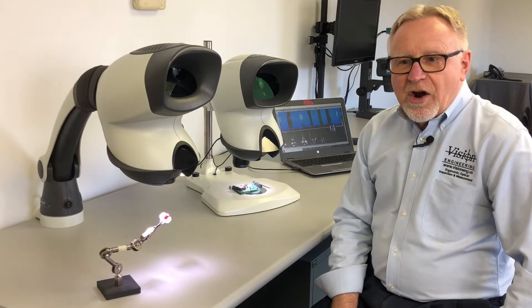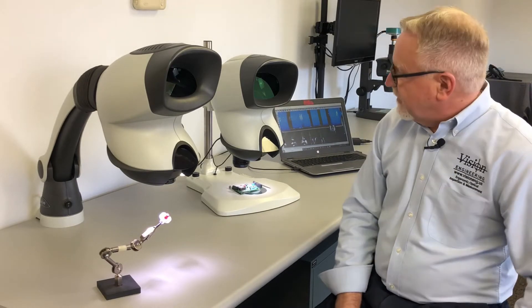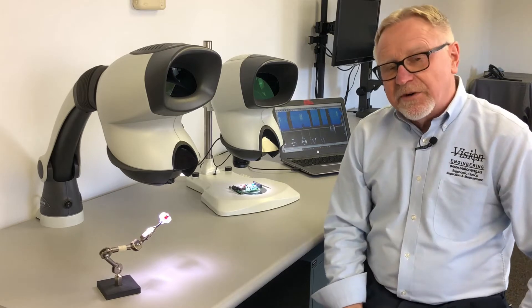Hi, I'm Gary Elm with Vision Engineering and today we're reviewing our most popular products to date, the Vision Engineering Mantis Compact and Mantis Elite Stereo Viewers.